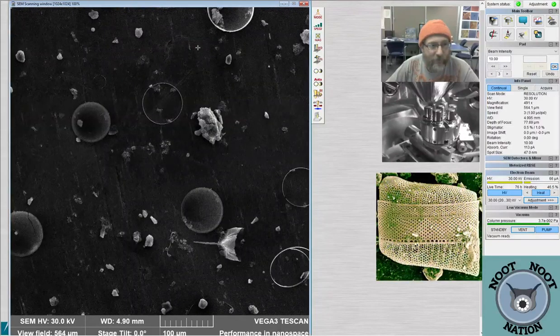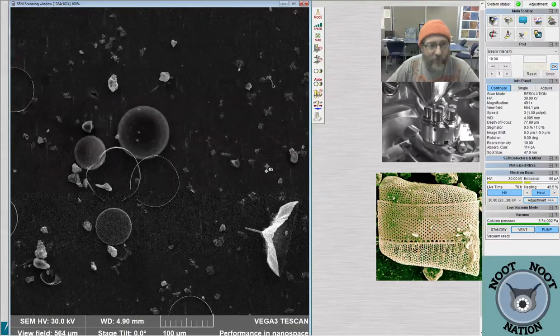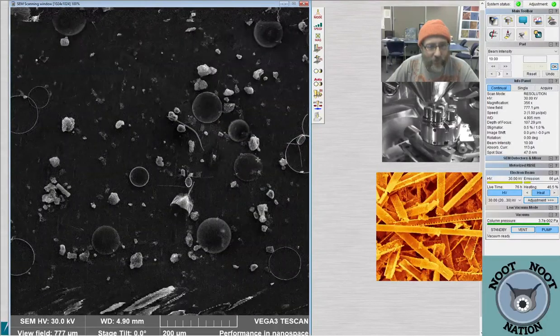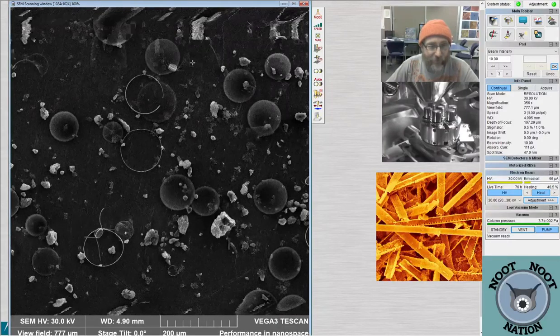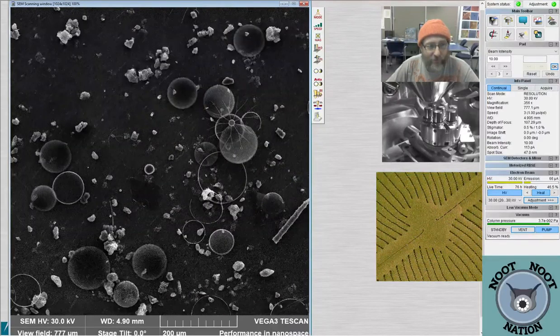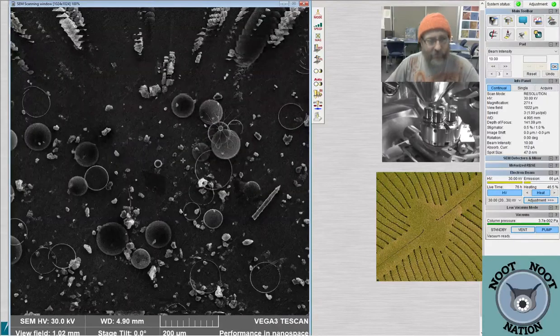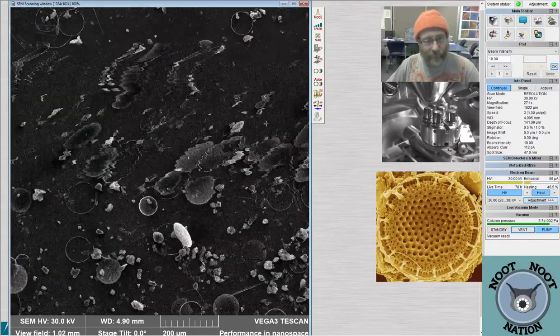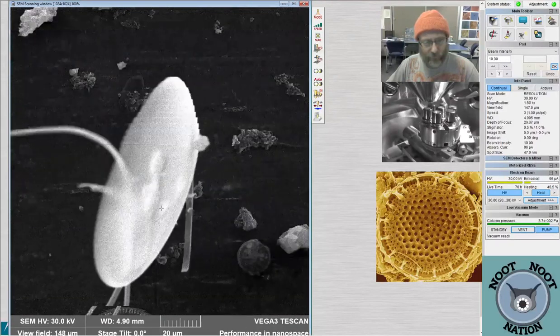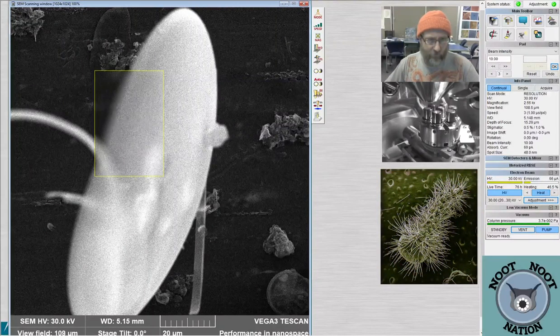Yay. All right, and Nolan says, let's see, all these microscopical creatures are beyond cool, but have we ever seen how they grow? What forces are in play when deciding their shape and texture? DNA. Yeah, DNA is at play. For the most part, it's DNA. That's how they grow. I mean, DNA is the instruction booklet of life, right? It is. There are environmental factors, because I know if you grow these marine diatoms in culture, they do start to change shape. Right? They have weird things that happen to them. They lose some of their wild characteristics, like domesticated diatoms.